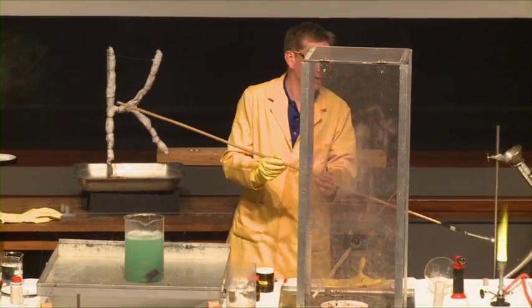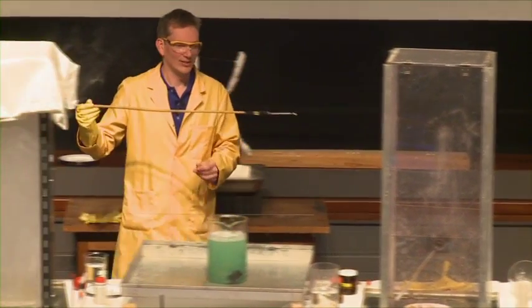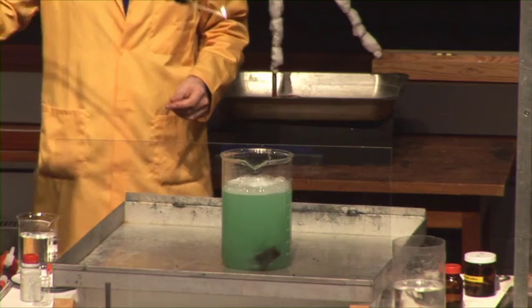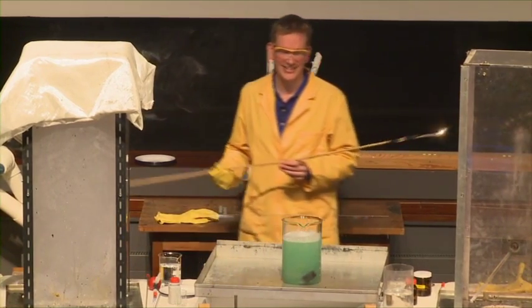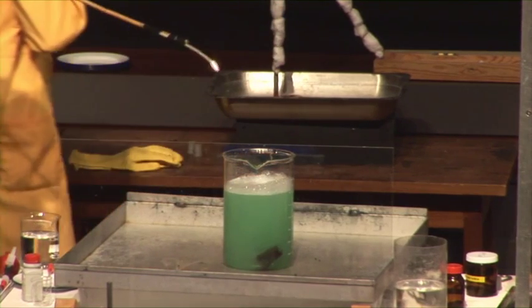Are we going to get one more? Maybe one more bang out of this? We'll let them build up a bit. That's not quite enough yet. Nearly there. Well, let's give that one a go.